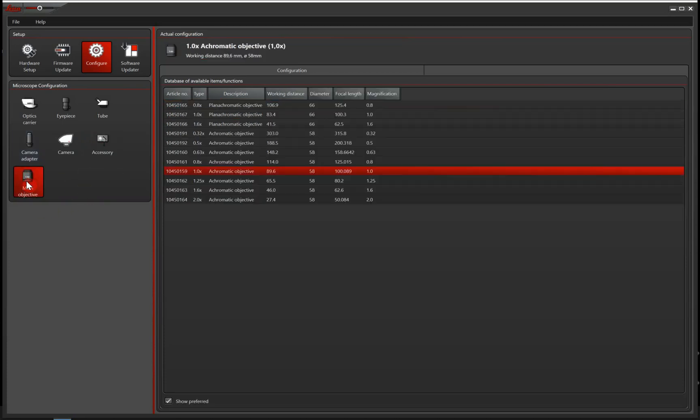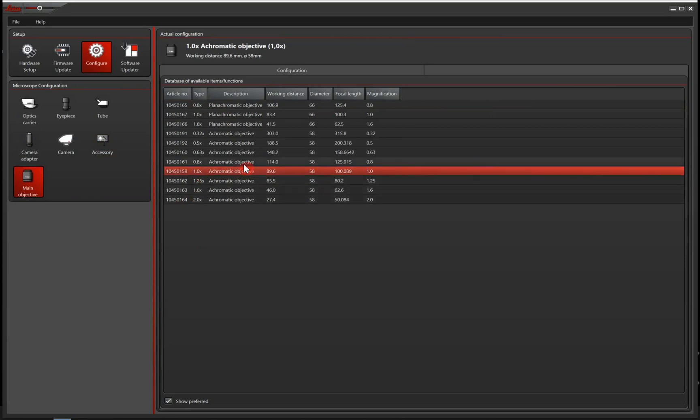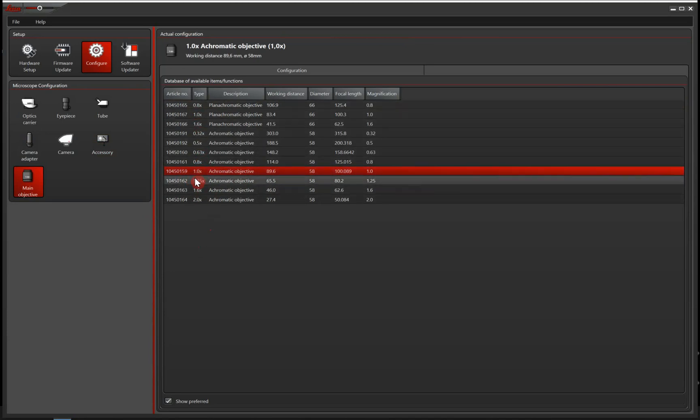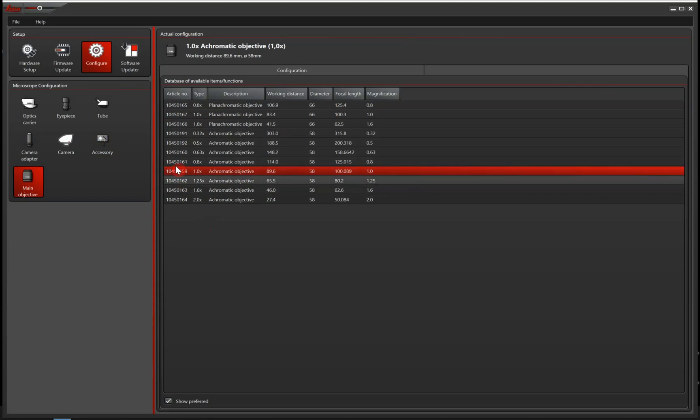And the last step is to tell the software what objective we are using. And again, important is that you get the magnification power correct. But if you find your exact objective, then it's great.